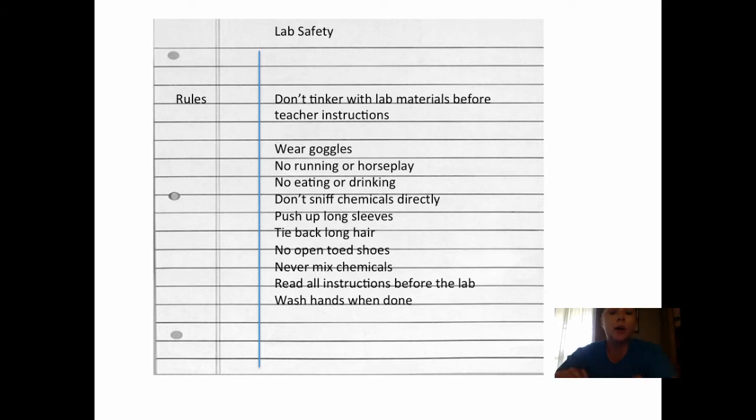Okay, so I went ahead for time reasons and put down the rules that you should have gotten. If you see on your screen, mine are typed in there just to save time because it takes so long. But we talked about to not tinker with the lab materials before the teacher instructions. Basically that means when you come into the lab, don't go in and start messing with any equipment. To wear goggles when the teacher tells you. No running or horseplay. No eating or drinking.